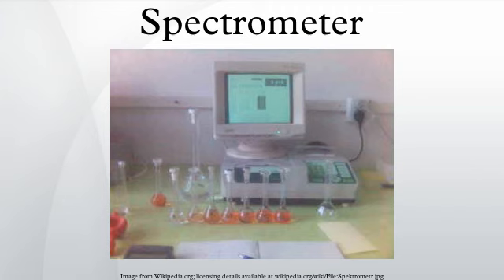In general, any particular instrument will operate over a small portion of this total range because of the different techniques used to measure different portions of the spectrum. Below optical frequencies, the spectrum analyzer is a closely related electronic device.